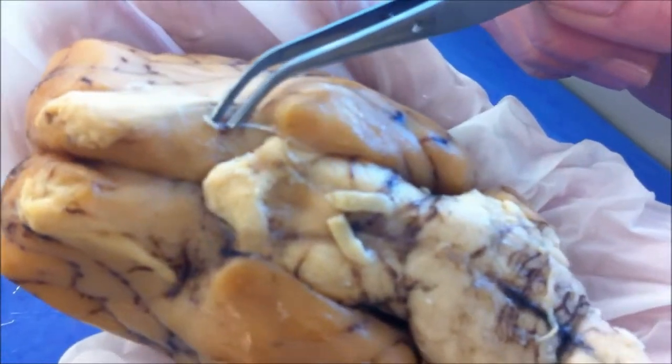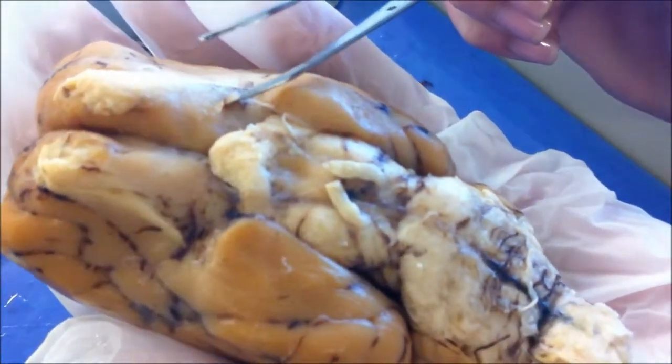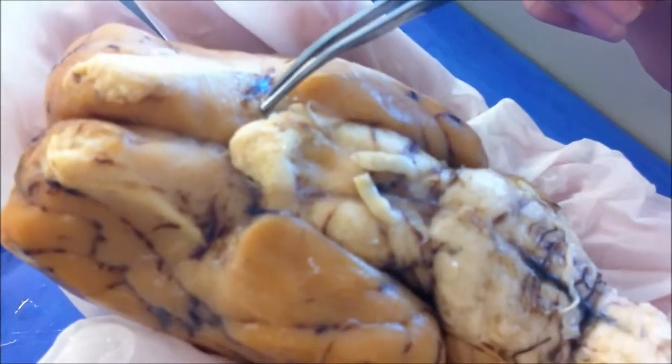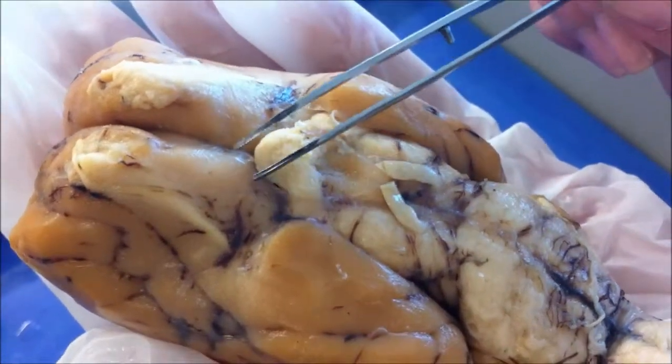It's very small, right in front of the optic chiasma. There it is, the optic nerve. There's only one on this brain, and on most of them there's only one. There's not one over here.